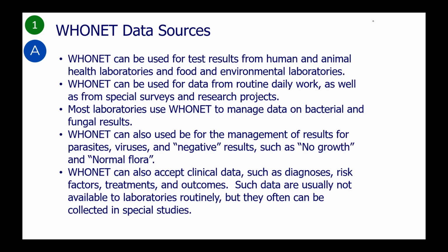WHONET data generally come from microbiology laboratories, which may include human and animal health laboratories and food and environmental laboratories. WHONET can be used for data from routine daily operations, as well as from special surveys and research projects. While most laboratories use WHONET to store data on bacterial and fungal results, it can also be utilized for results such as no growth and normal flora and viruses.